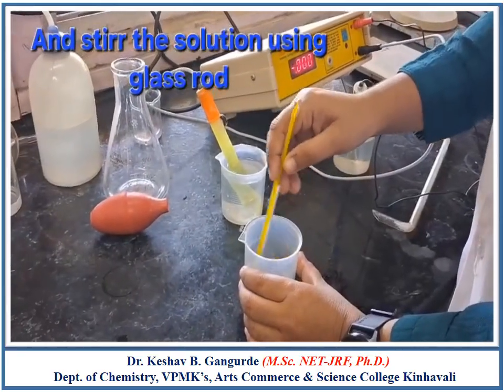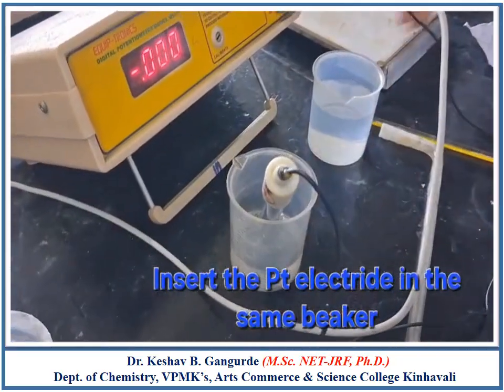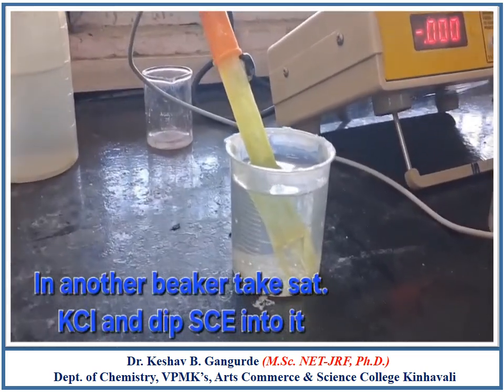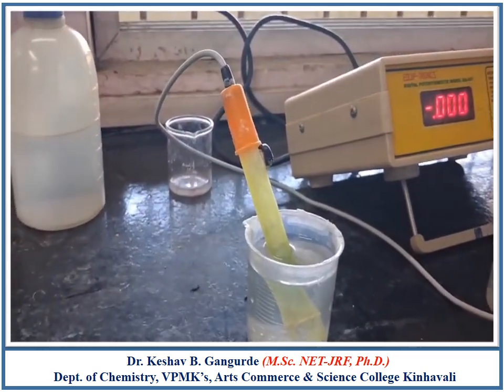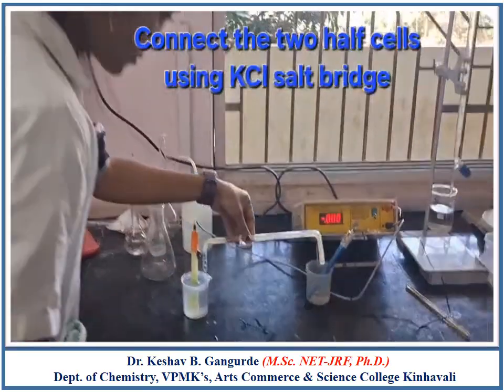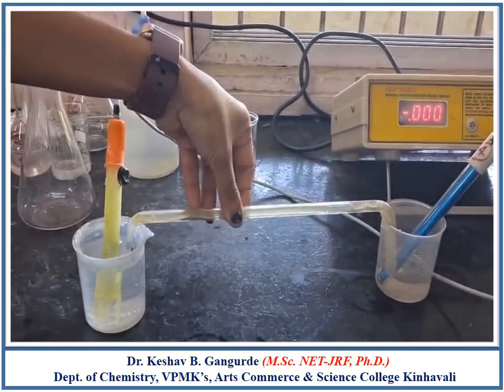Stir the solution by using a glass rod and insert the platinum electrode into the solution. In another beaker, take saturated KCl solution and dip saturated calomel electrode into it. Connect the two half cells by using a KCl salt bridge.